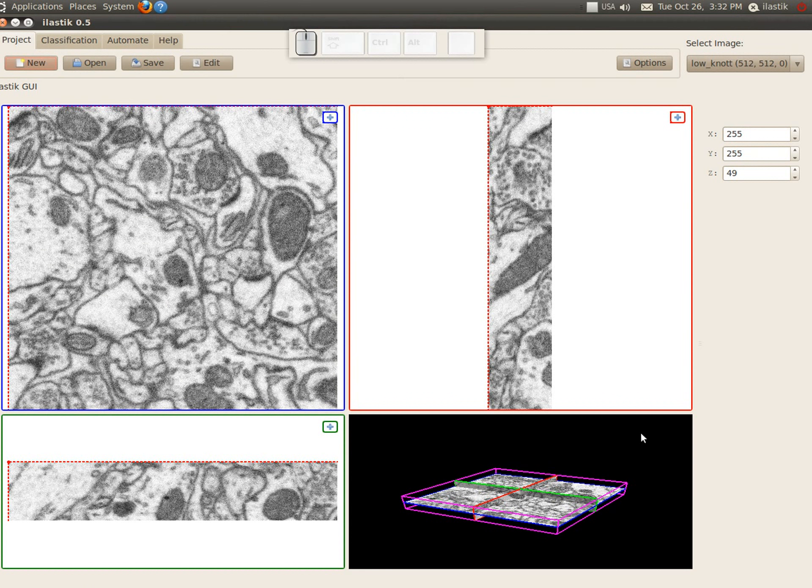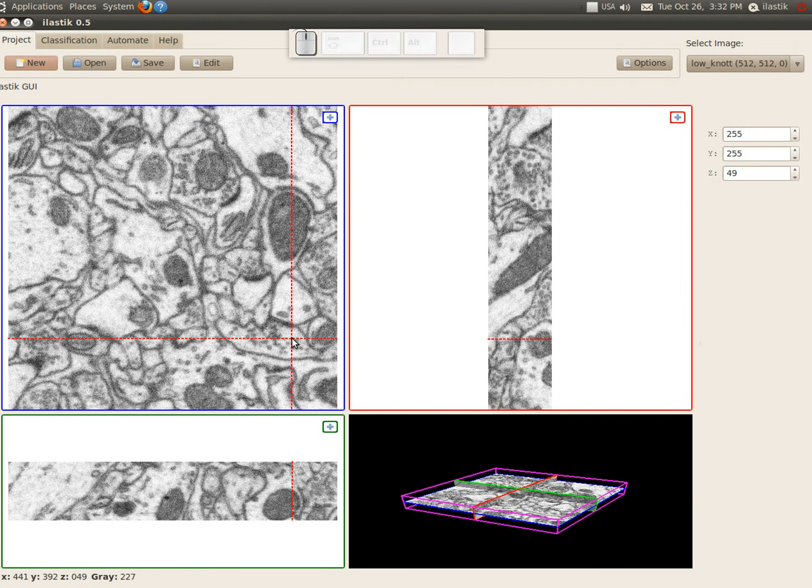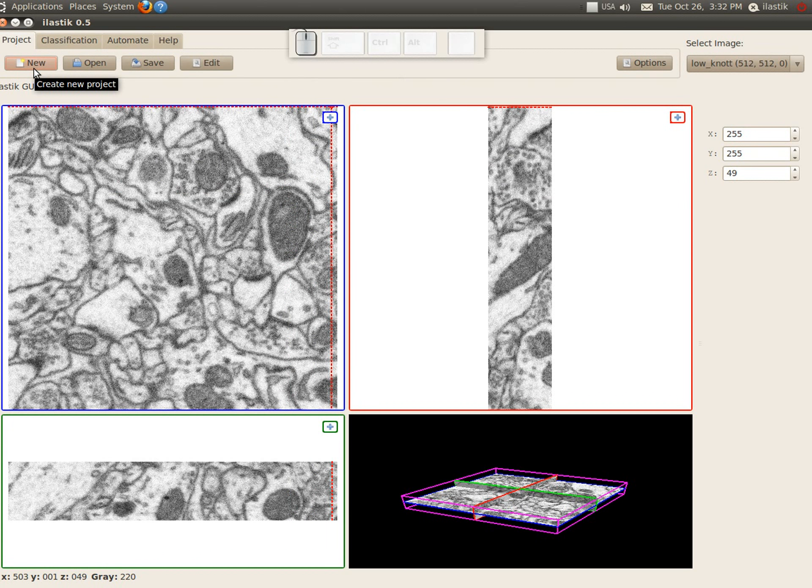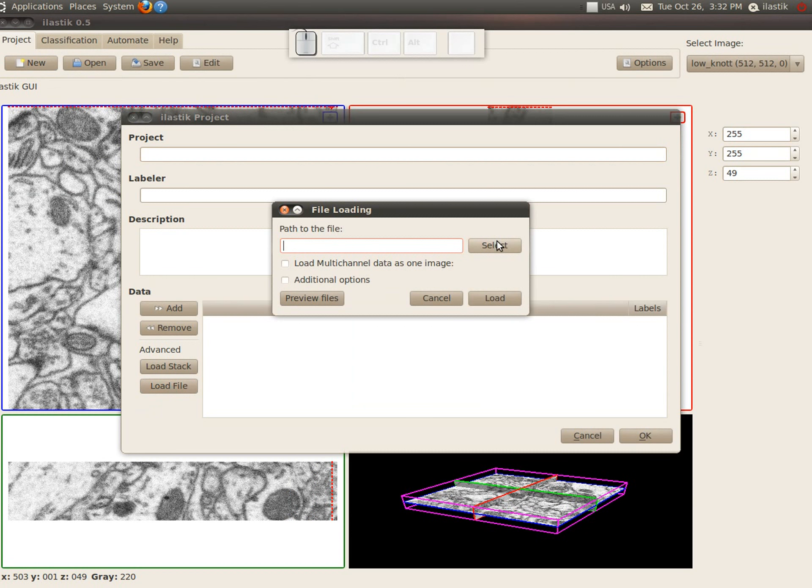And here, well, much better with the inverted colors. Now remember this file that we saved? Now we can actually load the whole stack from this one file. And that's what we have the load file button for.